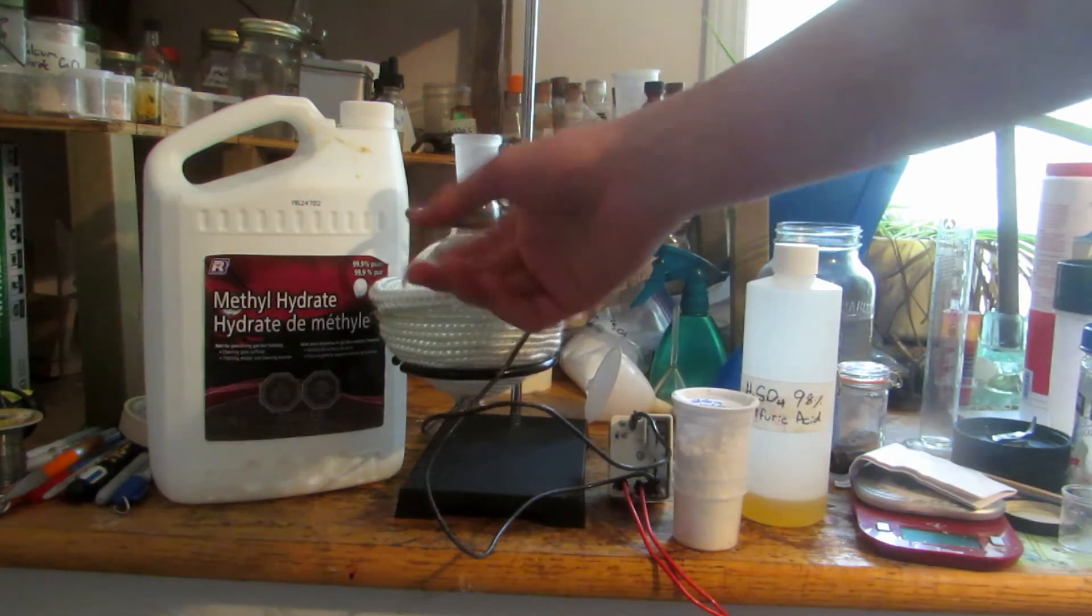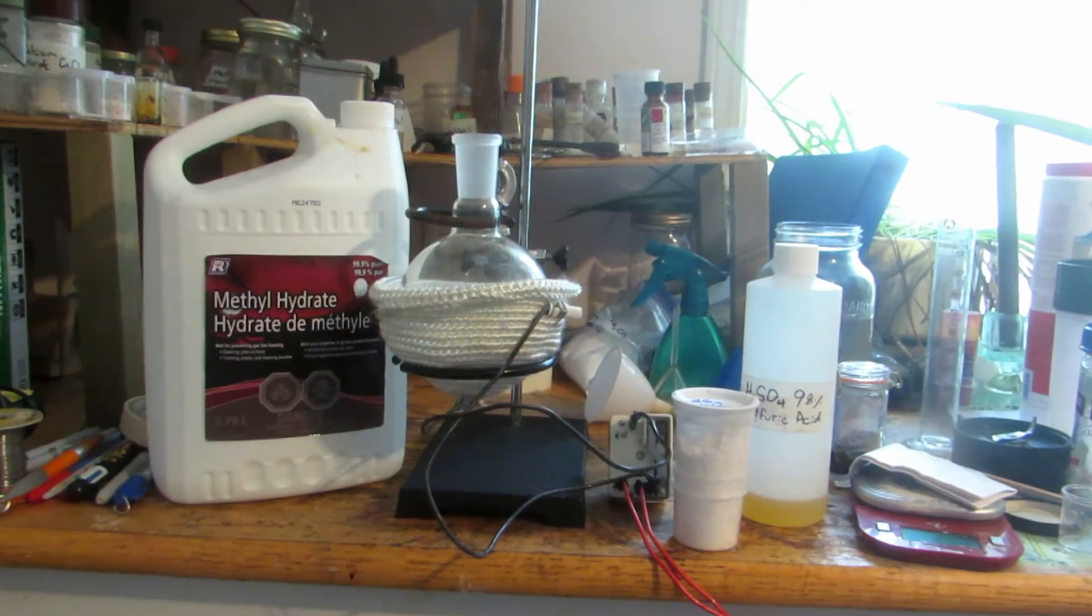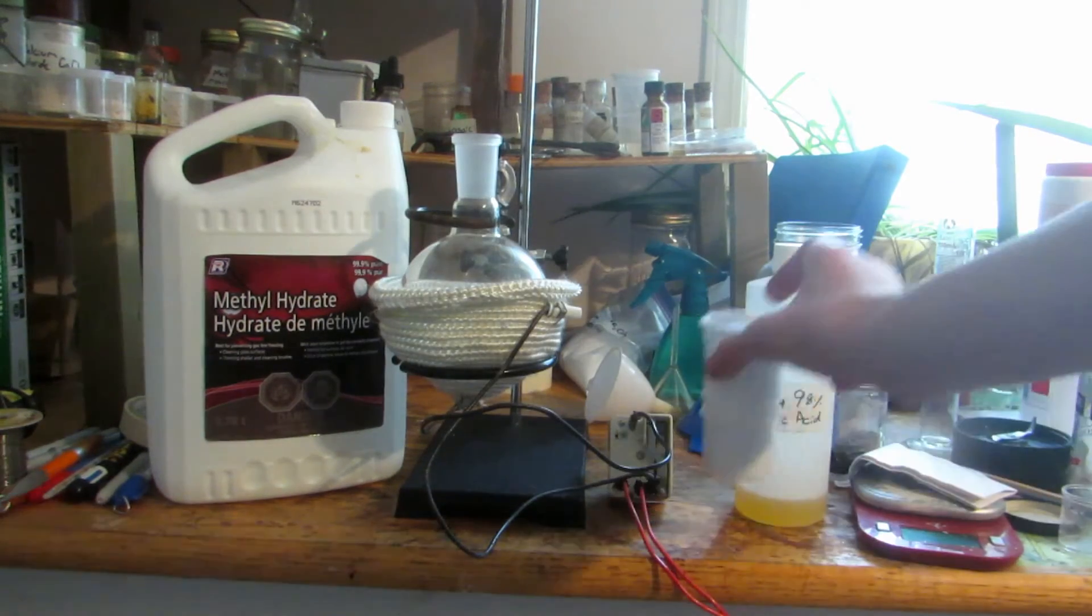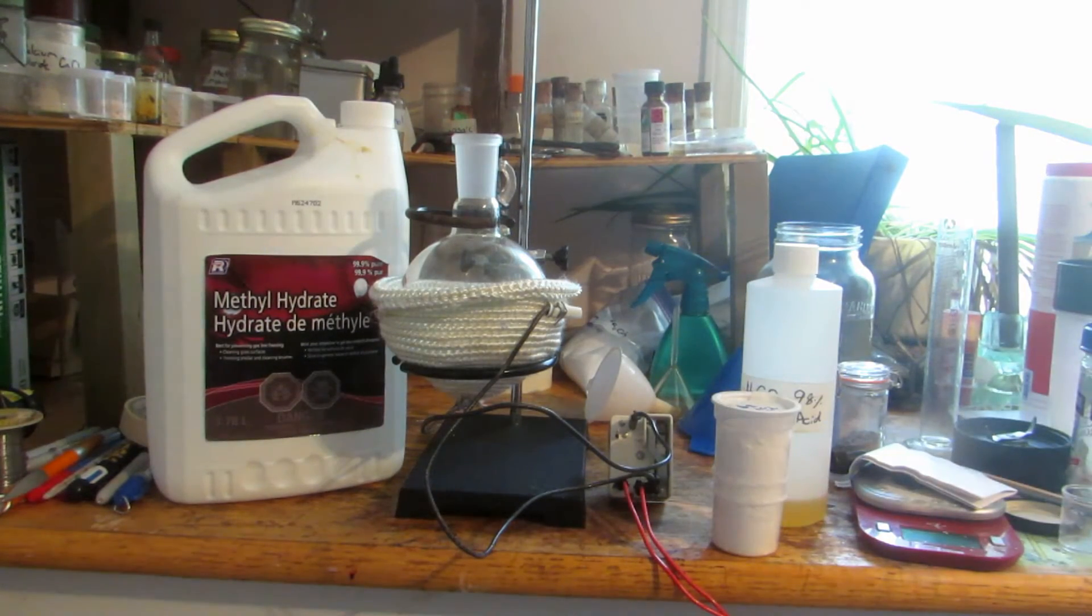We'll also need a 500ml round bottom flask and a heating mantle. The first thing to do is add 20 grams of salicylic acid into the round bottom flask, followed by approximately 100ml of methanol.